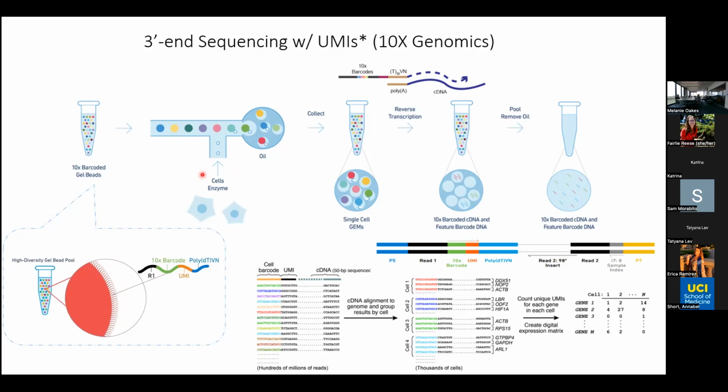So these beads, cells, and enzyme go into that cartridge here. We pipette them into rows. There's basically a pump that then makes an emulsion, and we take the emulsion out of the top here. The idea is that in this emulsion, your hydrogel beads down here dissolve, and all of these primers are released within this droplet. At the same time, your cell is lysing. So you have two things happening in that droplet.